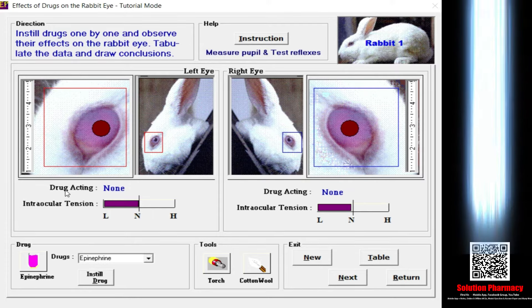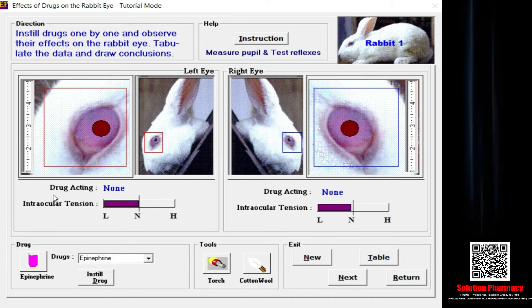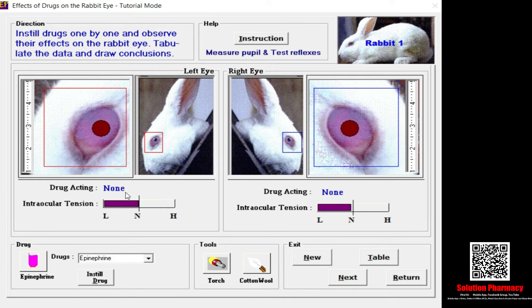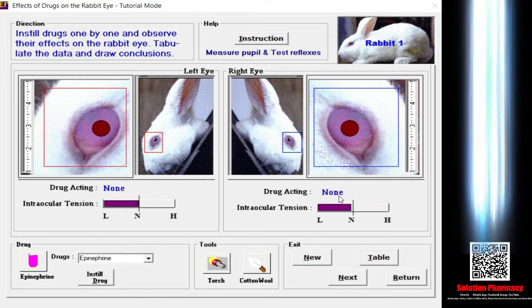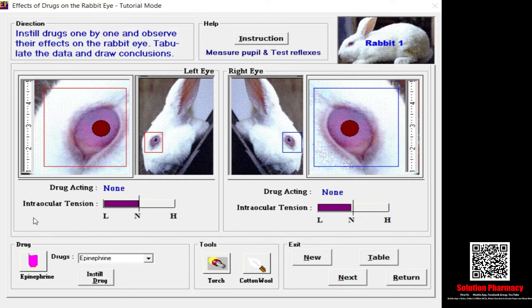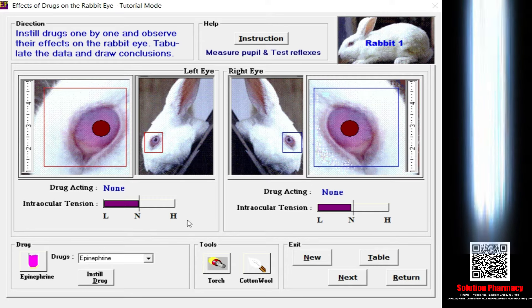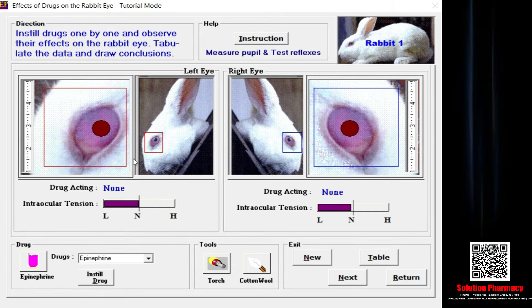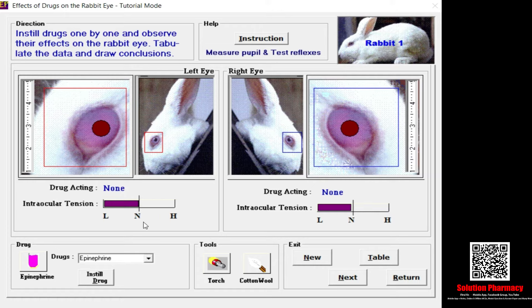You can see a label called 'drug acting.' Since we have not selected any drug, it shows 'none' for both left and right eyes. Under this tab you can also see intraocular tension with a remark ranging from low to high — L stands for low, N stands for normal, and H stands for high. Since no drug has been included, intraocular tension is currently normal.